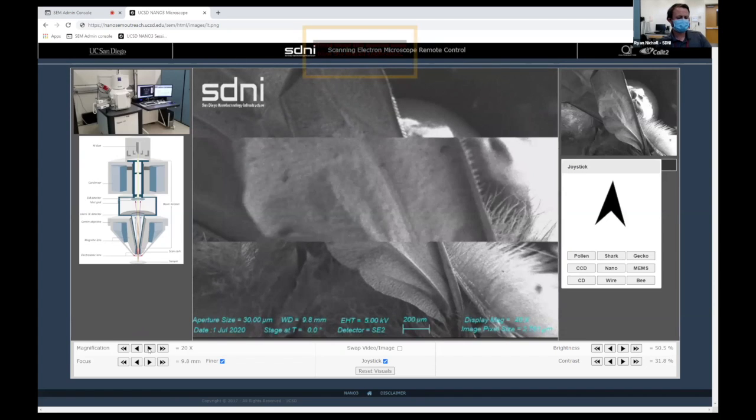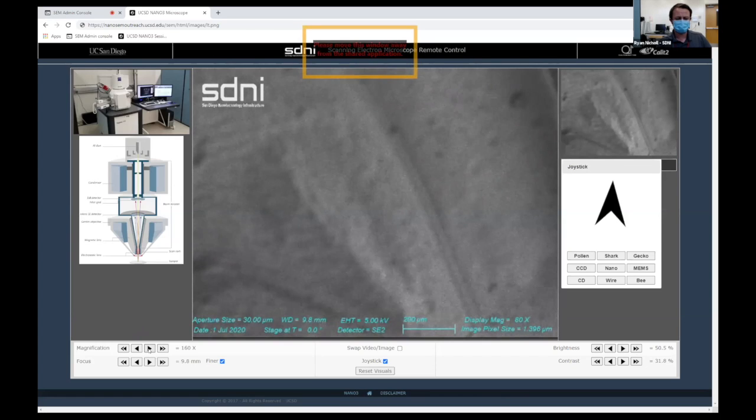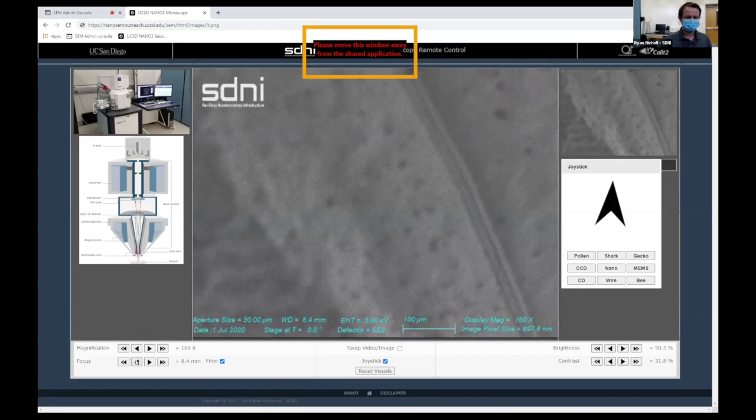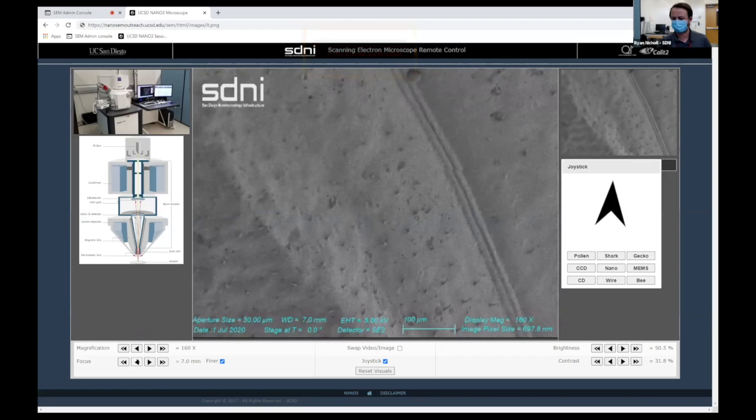So we developed a lesson where we put in, I think, 9 different varieties of pollen and supplemented her laboratory class by first having the students look at the pollen under the optical microscope, and then she could leverage this $500,000 instrument to go in a little bit more depth to show her students not just still images from textbooks, but to actually use the system live in her lab, exploratory.